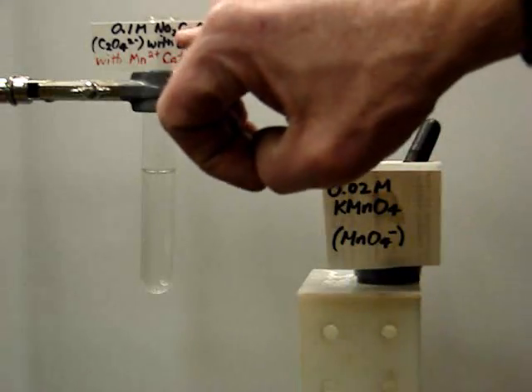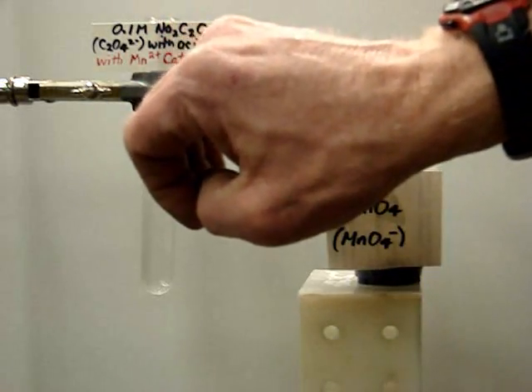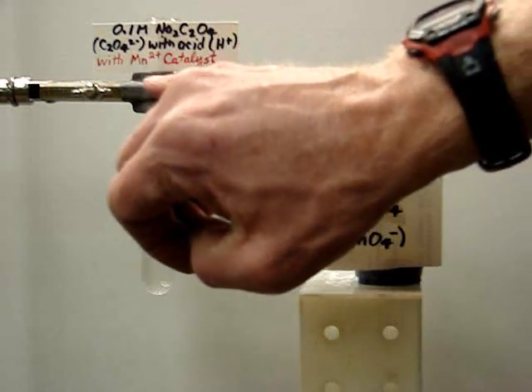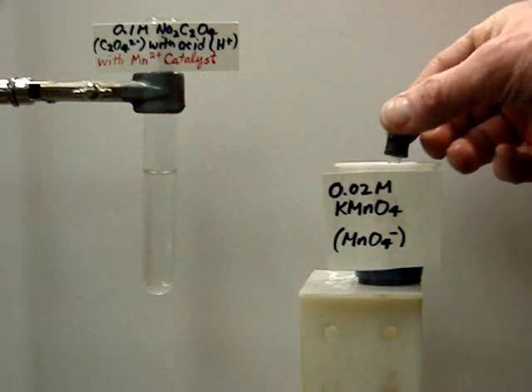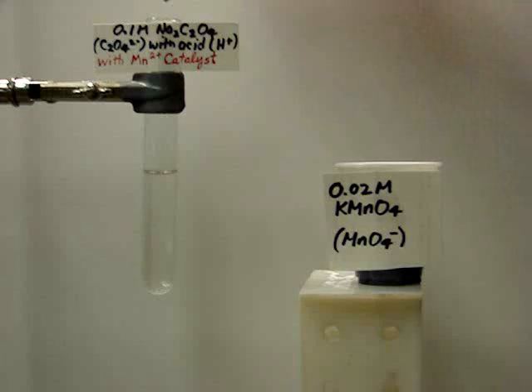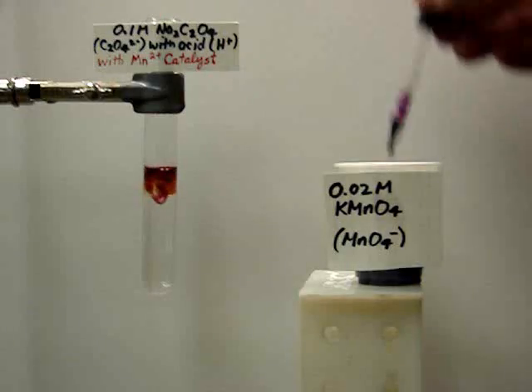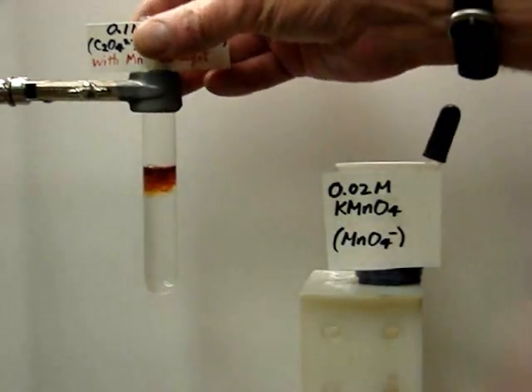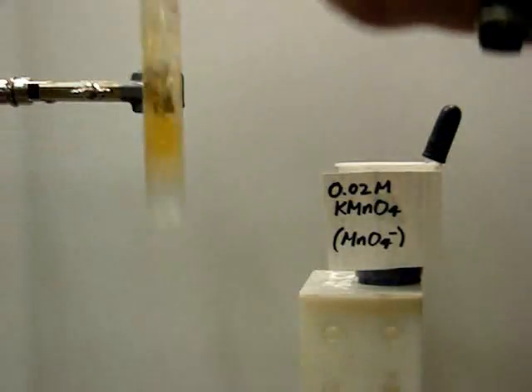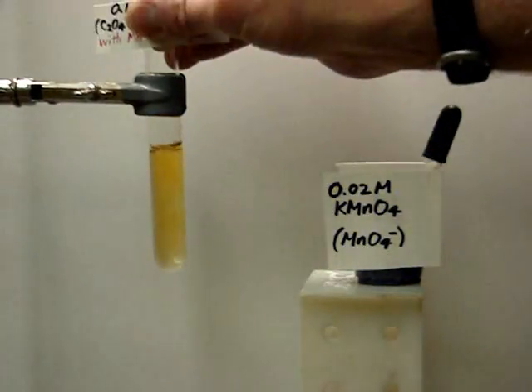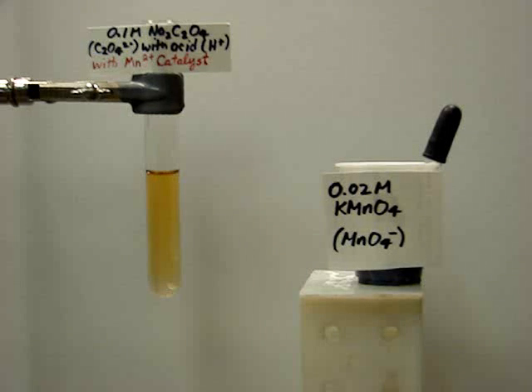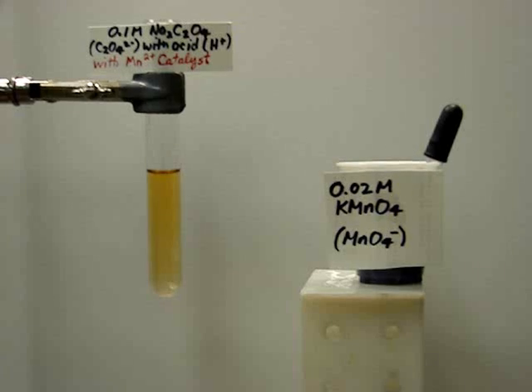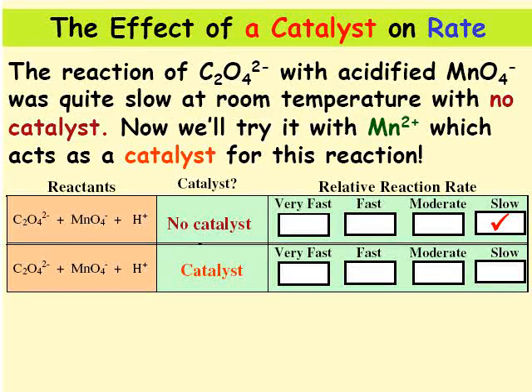Now we're going to put some KMnO4 in a solution of sodium oxalate C2O4^2- with acid. And this time it has Mn2+ as a catalyst. So let's put in five drops. And we'll give it a little shake. You can see the color almost immediately changes to yellow. So now we can mark in FAST for the catalyst.